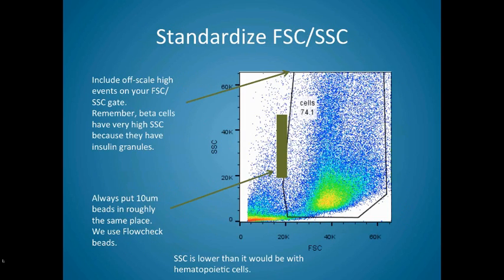The other thing that we find tremendously helpful is standardizing our forward and side scatter plots, and we do this by running 10 micron beads.